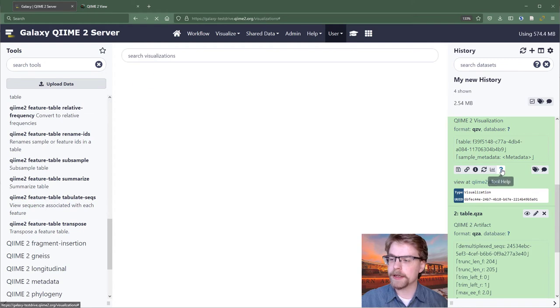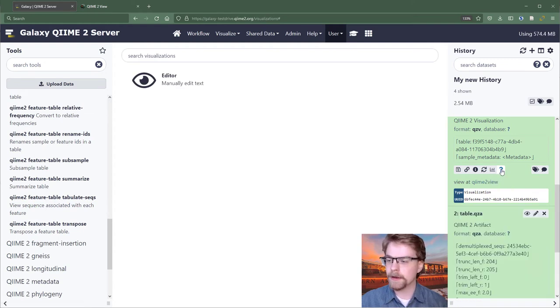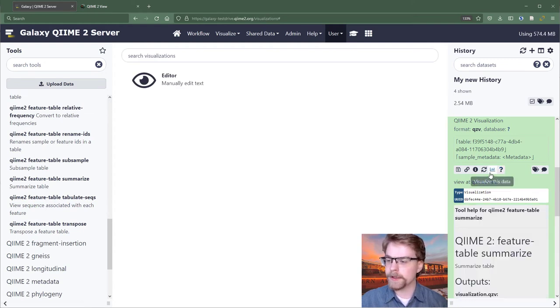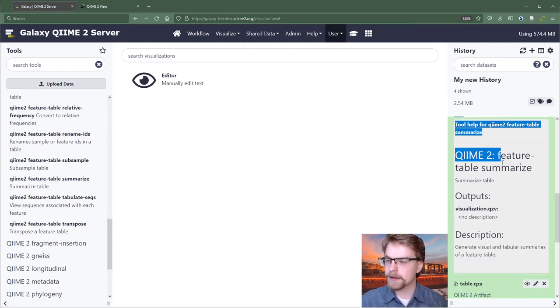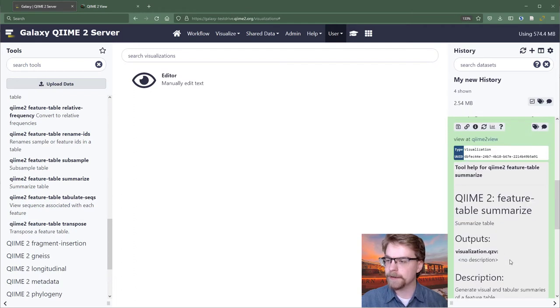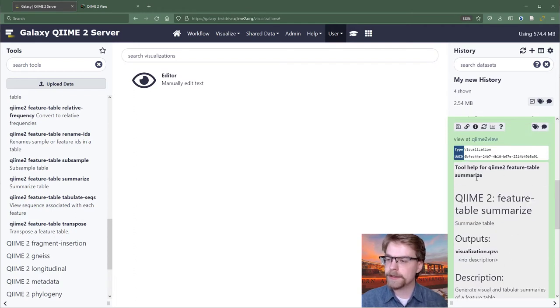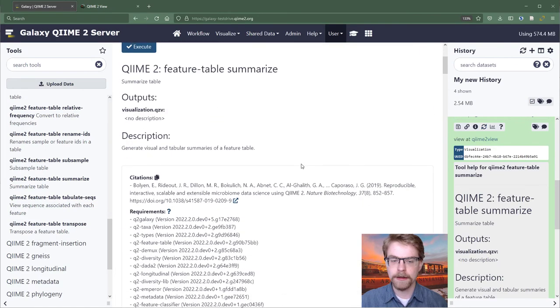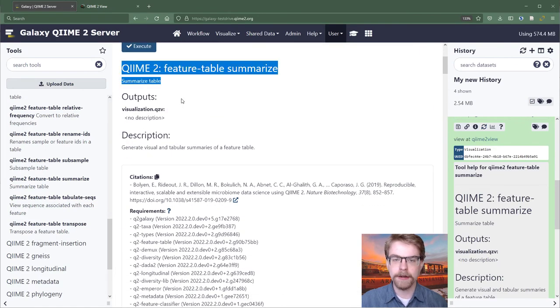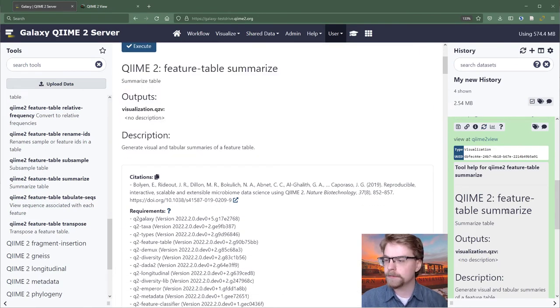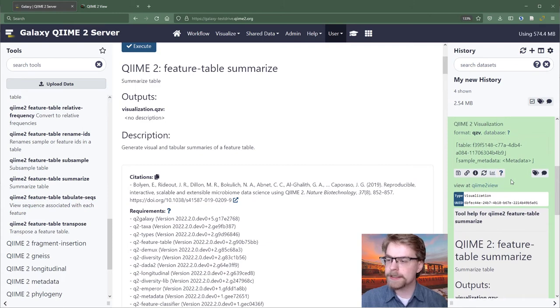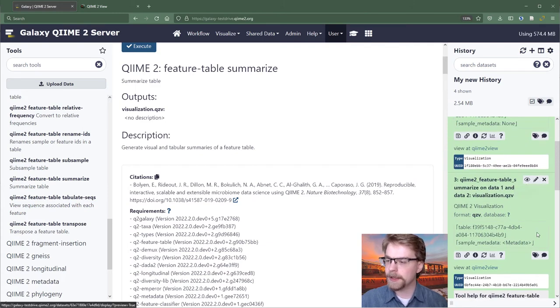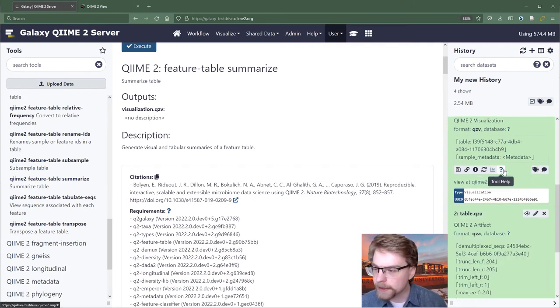Finally, we can look at tool help, which expands the help text right underneath this box here. And so that's the same information that we can see down here.